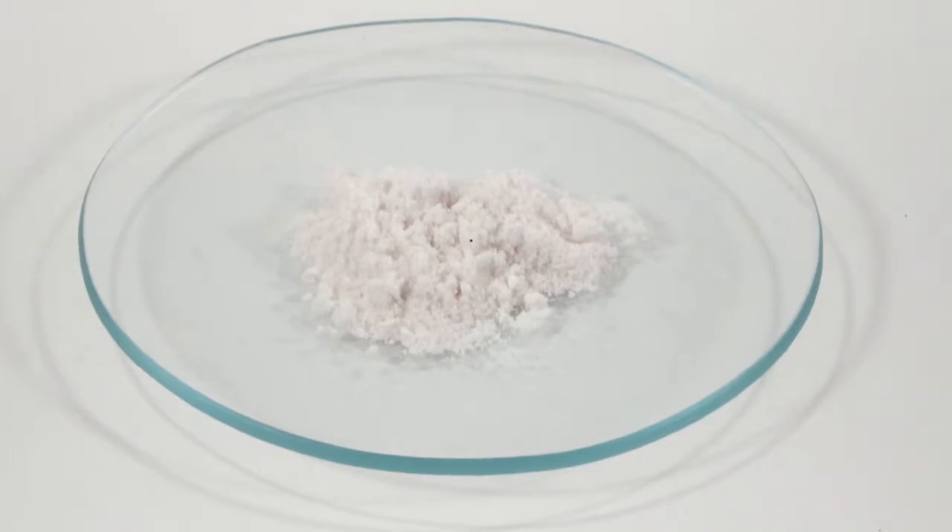As with most manganese(II) salts, the sulfate has a light pink color. This is the monohydrate. The anhydrous salt is a little closer to white, and the tetrahydrate is a bit darker pink. It's fairly soluble in water, but depending on which reference you look at, its solubility in alcohol is either really, really good or non-existent. So first, let's find out which it is.